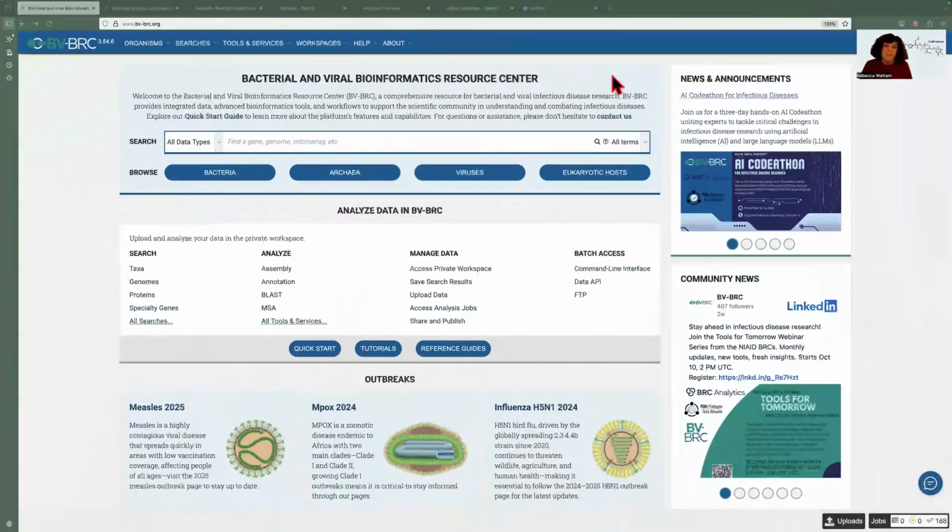In this particular video, we're going to step through submitting a BLAST job at the BV-BRC. But first we have to decide, what are we going to blast? What are we interested in? Well, if you watch the introductory video, you know that I really like these penicillin binding proteins.